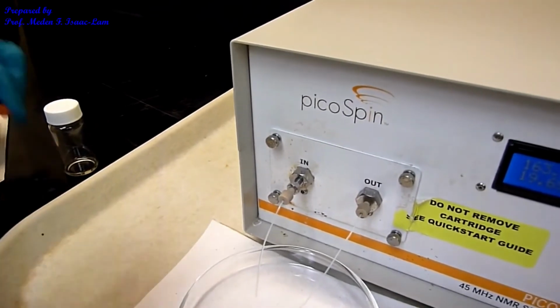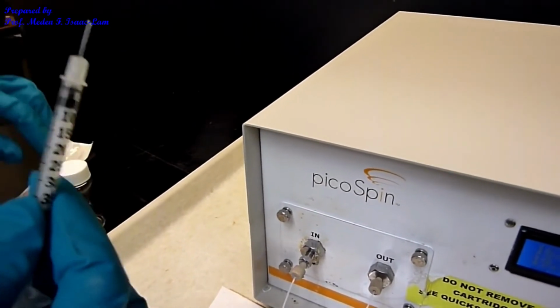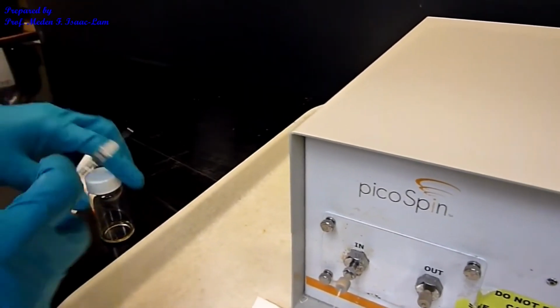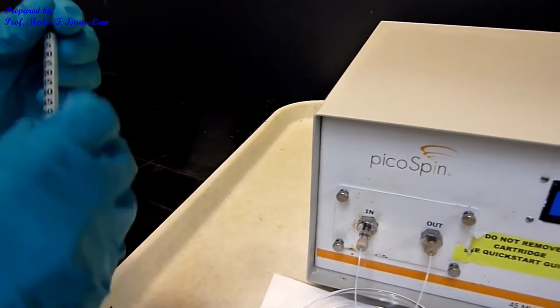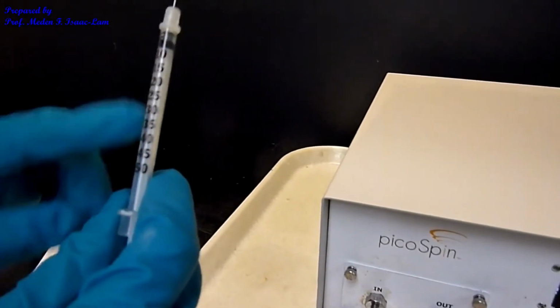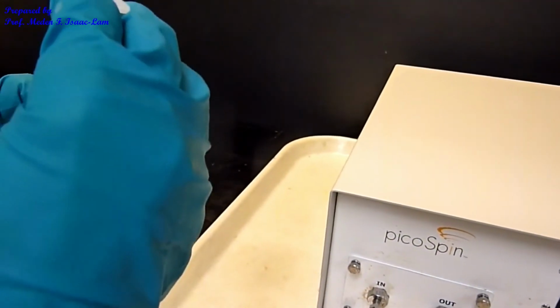And again, I have a syringe in here, so I'm gonna withdraw about 200 microliters. So this is half a ml, and I'm gonna use this to withdraw.